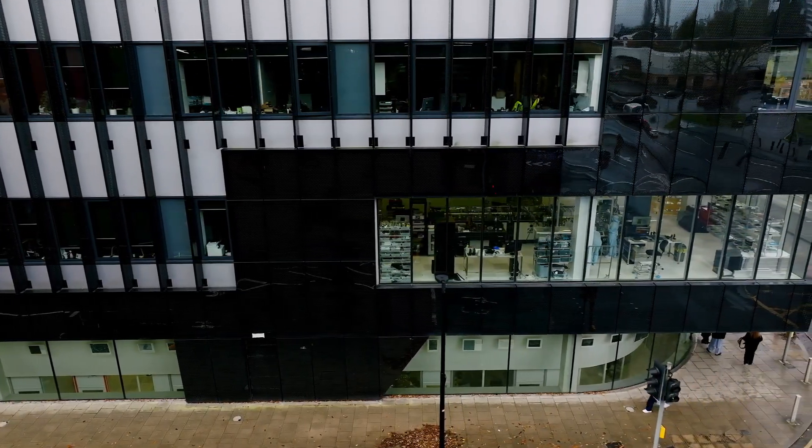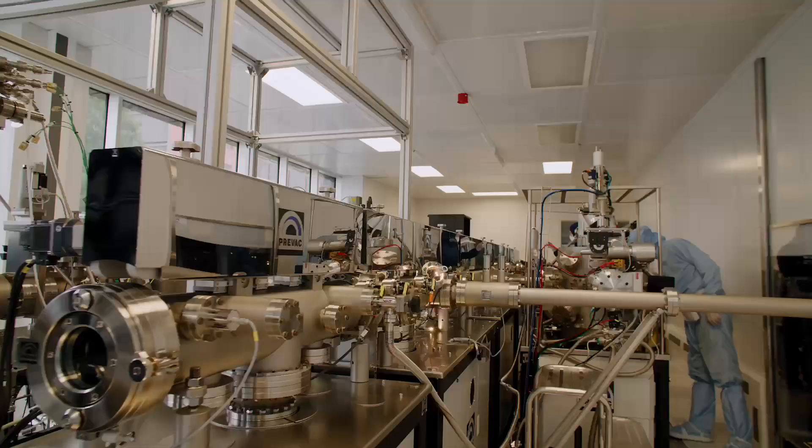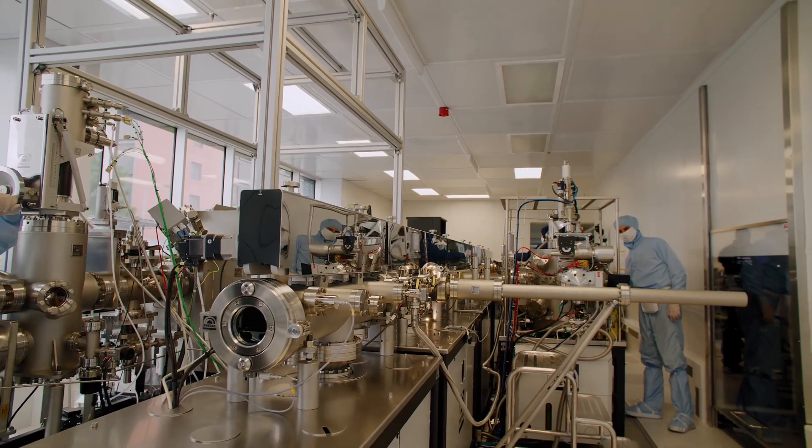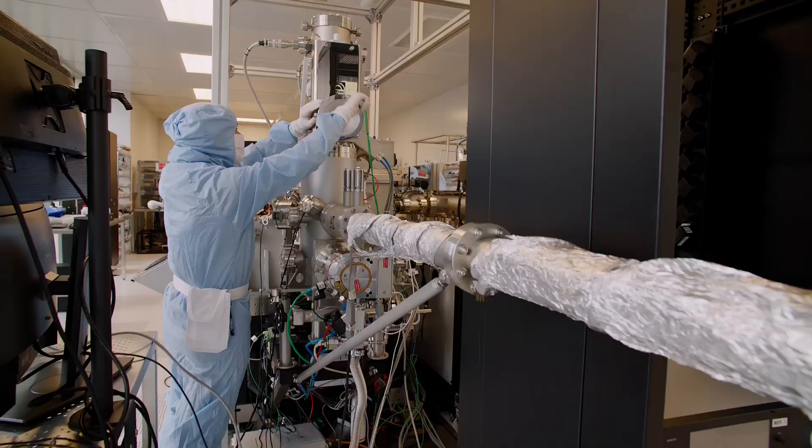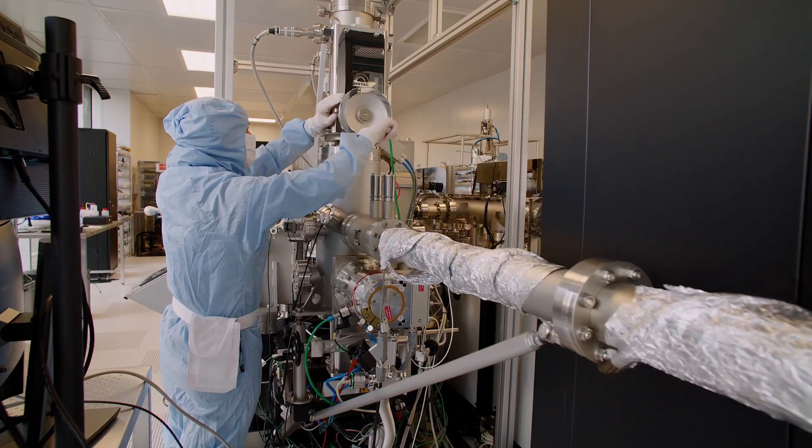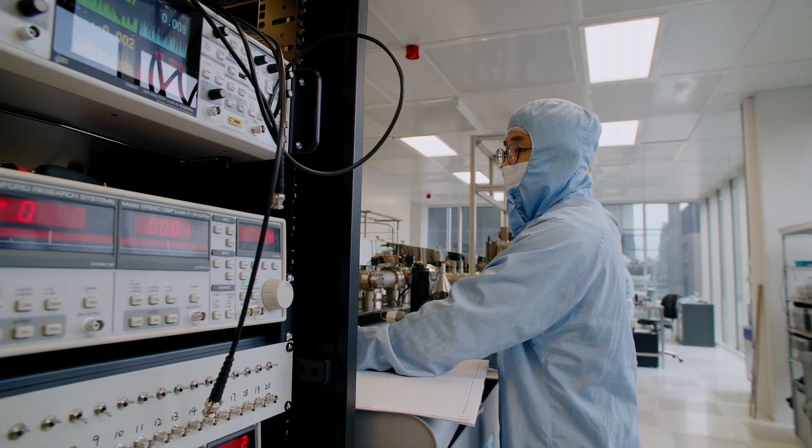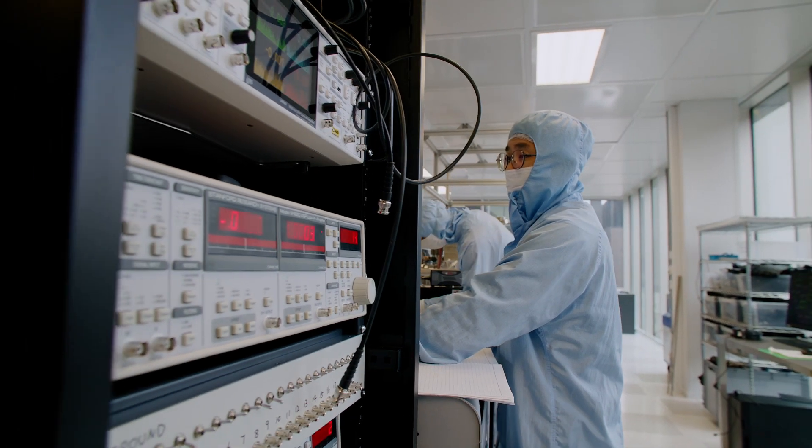The UHV system is designed to create ultra-clean environments for nano-fabrication of 2D materials, with two primary goals. One is to advance fundamental science, and the other is to develop transition towards applications.